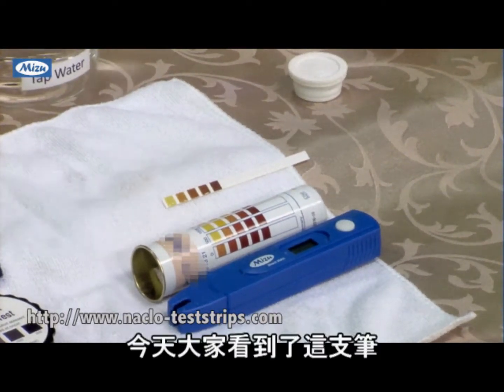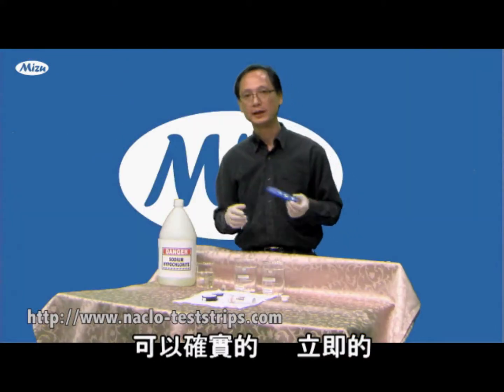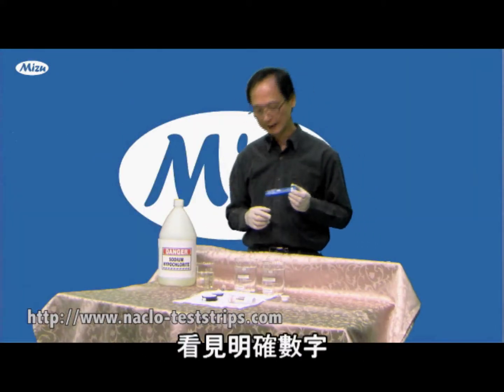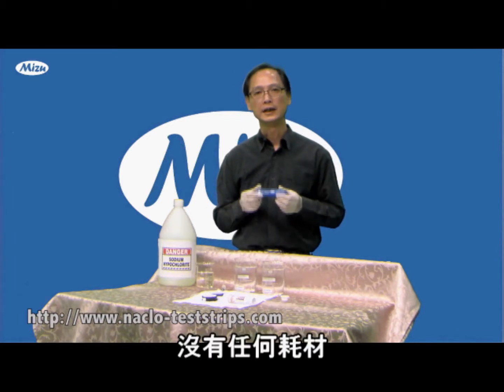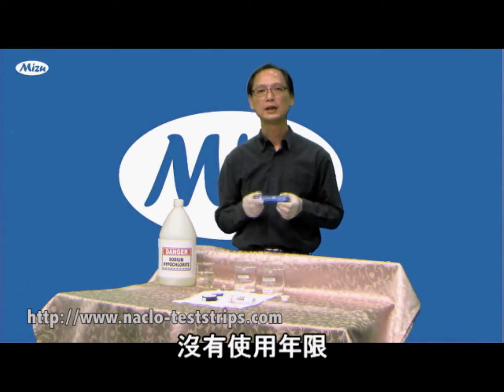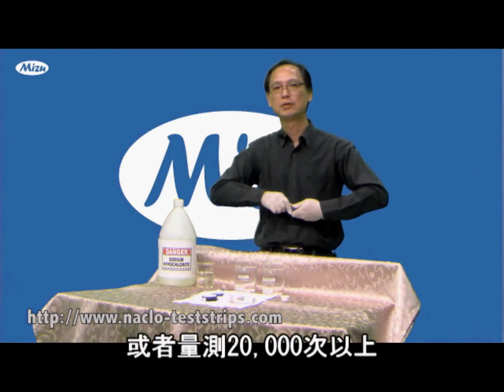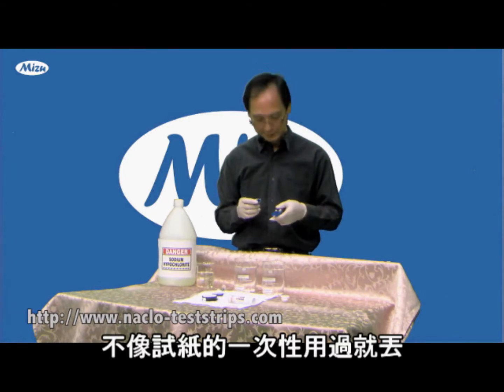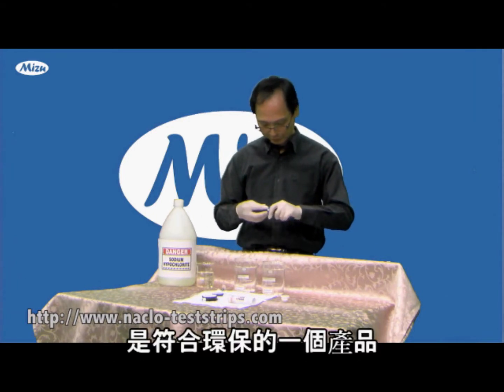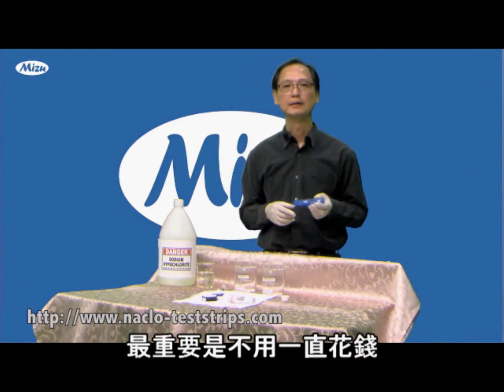Today we showed you that this pen can replace your test strip. You get the exact number instantly, and it's a durable product. With one battery you can use it more than two years or 20,000 measurements. You don't throw anything away, and you save your money. Thank you.